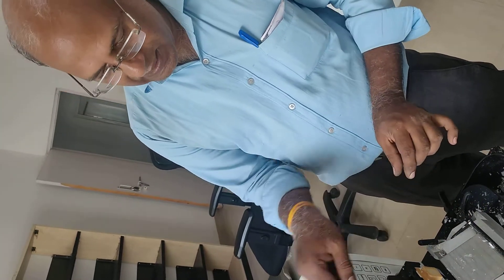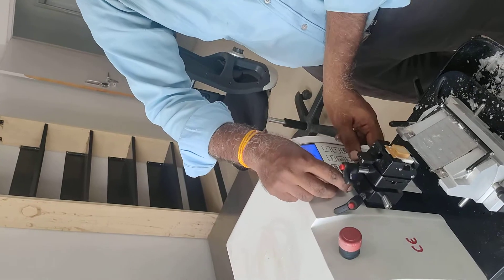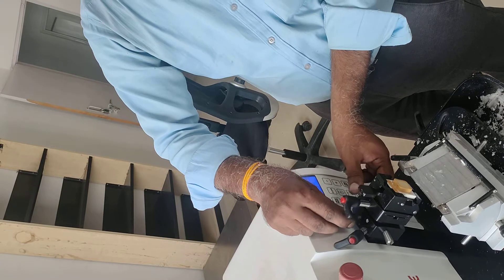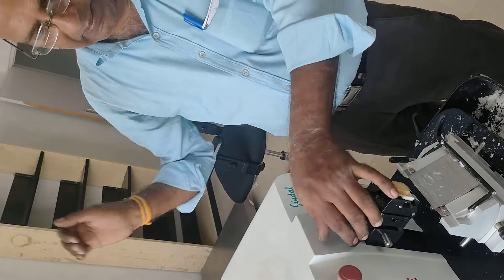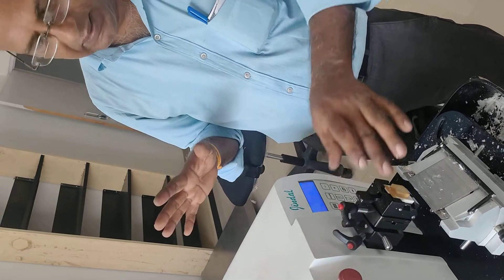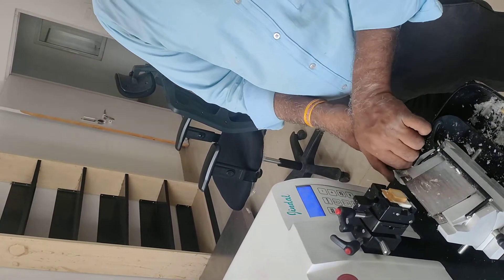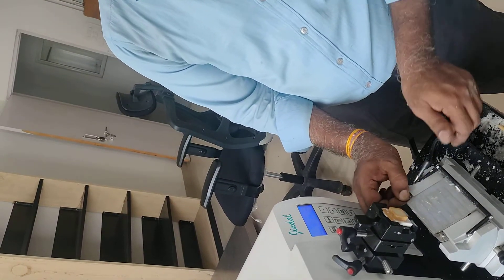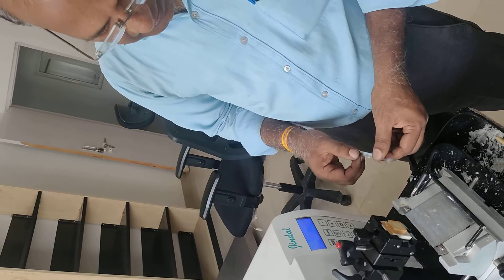Now, we will loosen the lever to angle-adjust the lever. This is how we loosen the lever and adjust the lever. This is how we adjust the angle and lock it from here. This is how we loosen the lever and lock the lever. This is how we lock the blade.